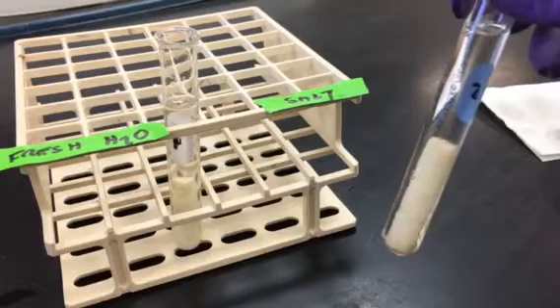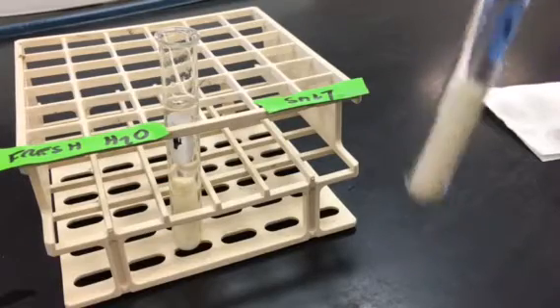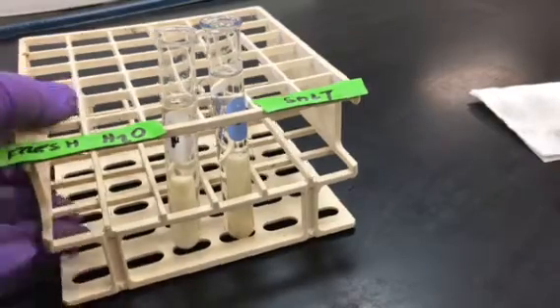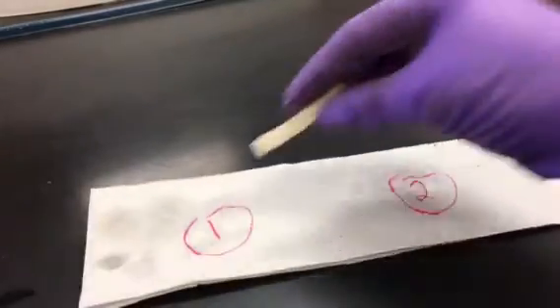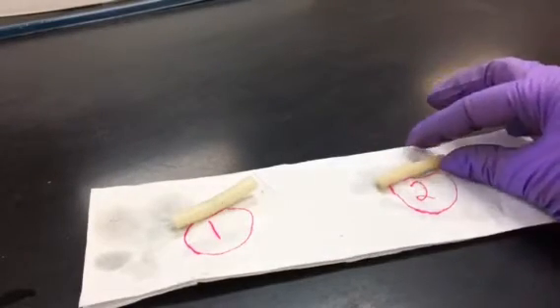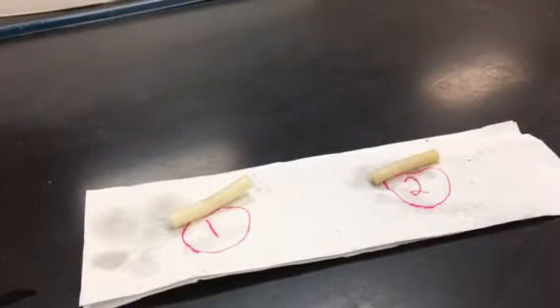The potato strip is submerged underneath the water. They soak in this environment for about 45 minutes to an hour, and then we're interested in what has happened to those potato strips relative to the movement of water. When we pull those potato strips out of the tubes, there's potato strip number one and there's potato strip number two.